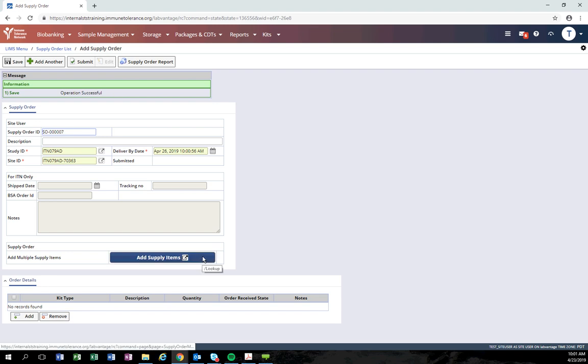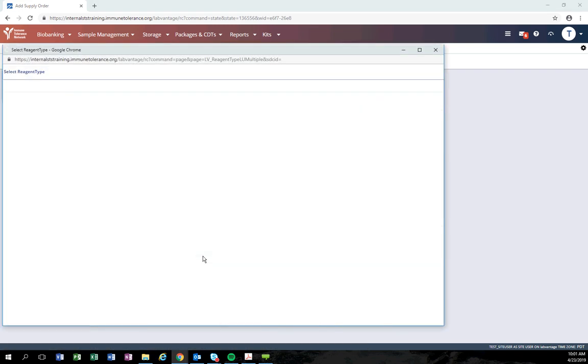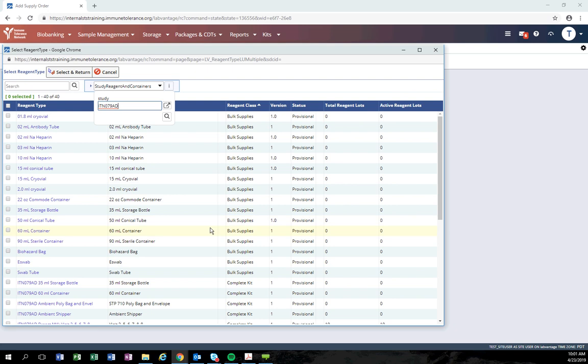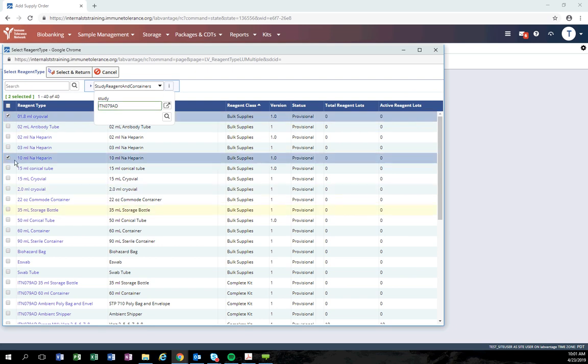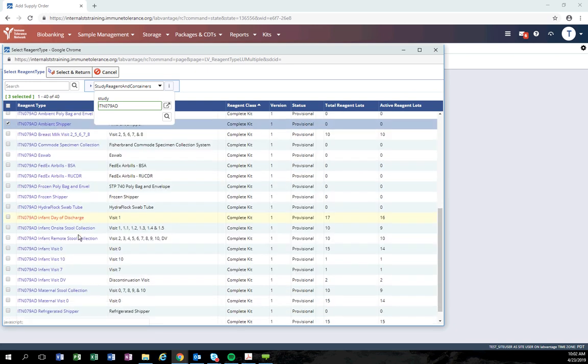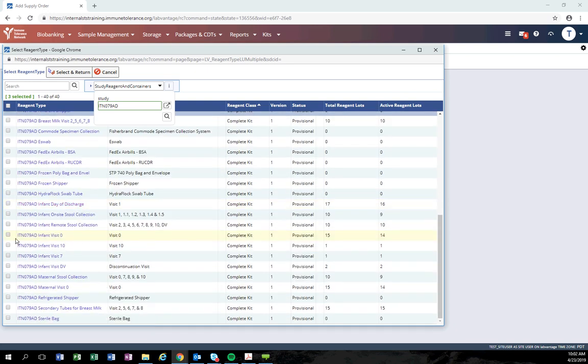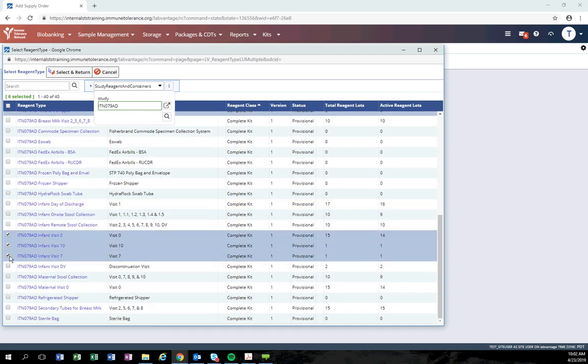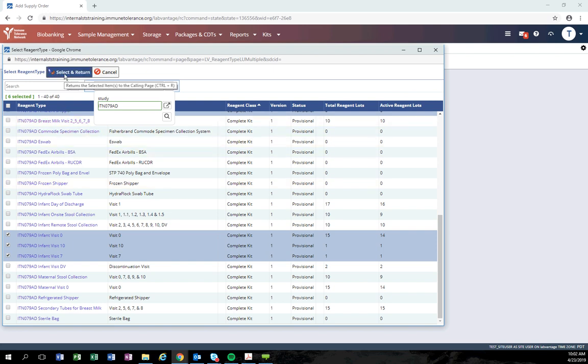After clicking save, click the add supply items to add the individual items to your order. The system will open a new window that has all of the items available for the study you selected. Click the checkbox next to the items that you would like to add to your order.